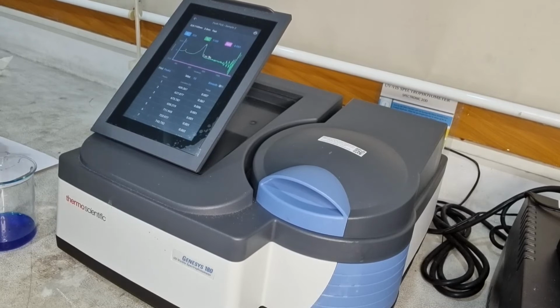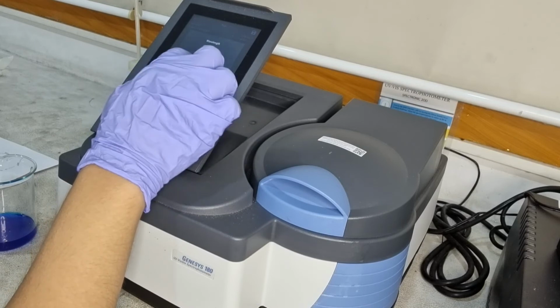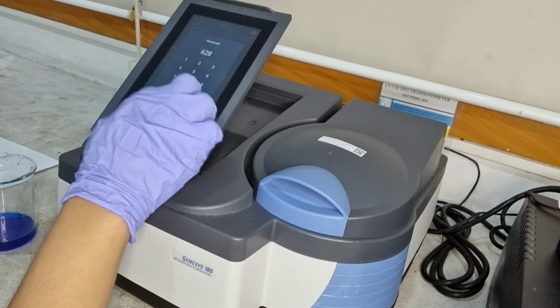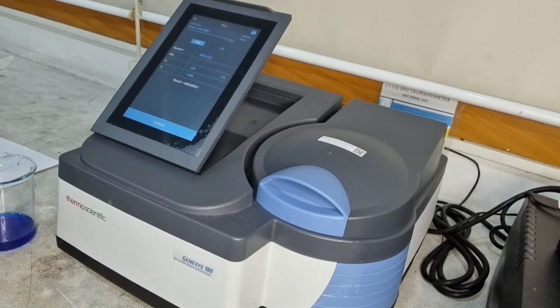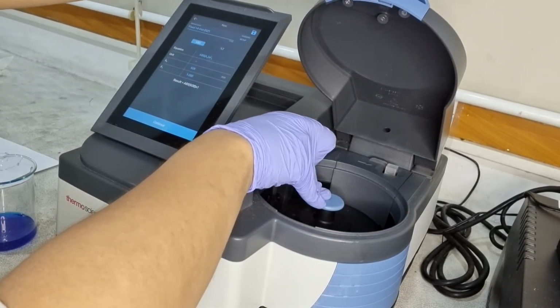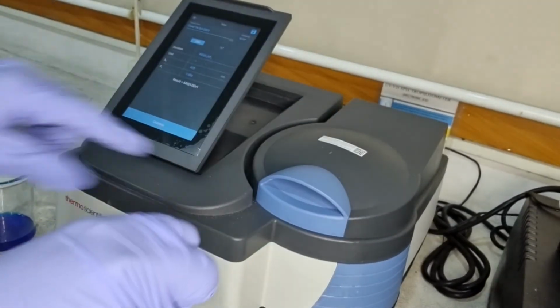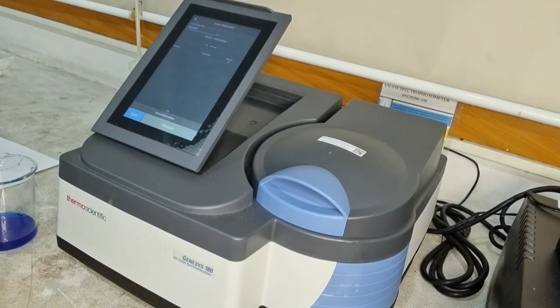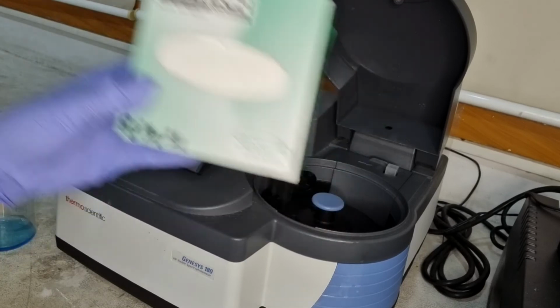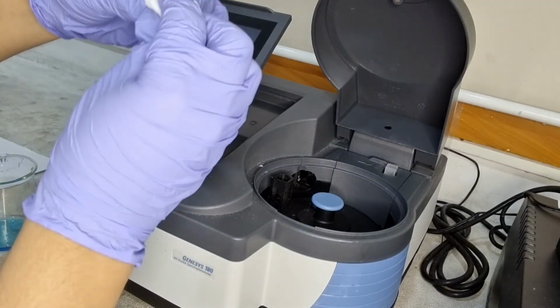I then set my wavelength to that value and start measuring my standard solutions. Because I'm dealing with liquids, I have to rinse the cuvette 3 times before reading. I'm also taking care not to have anything that will obstruct the light. The inside must not have any bubbles, and if I need to wipe the sides of the cuvette, I'm using a special type of delicate wipe and I'm just tapping, not rubbing, to clean.